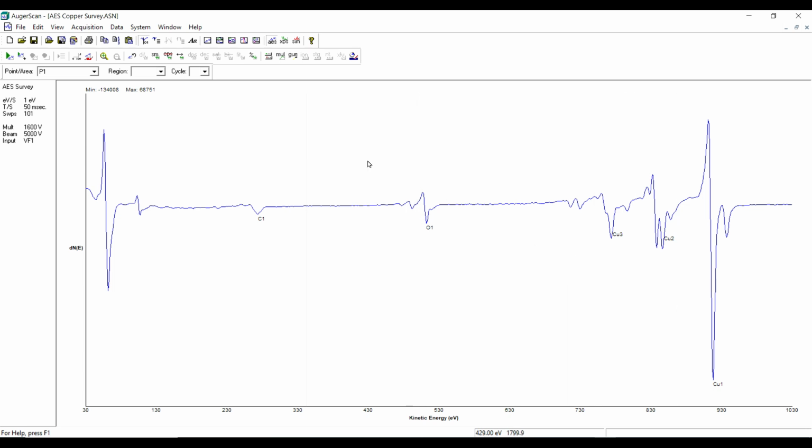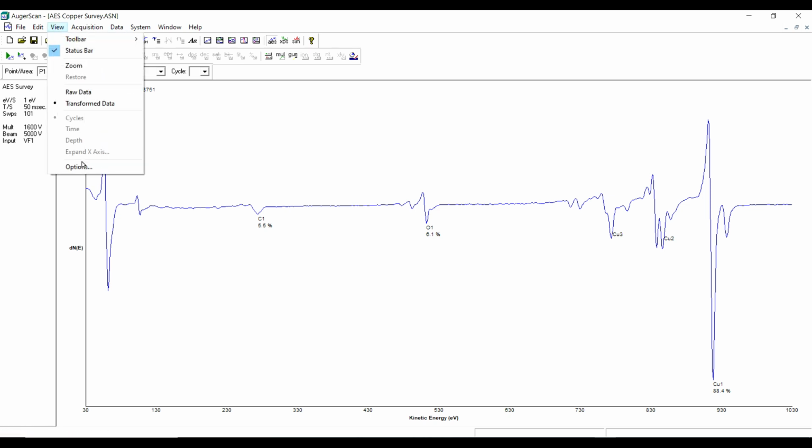And the reason we did it that way was because when we first started designing this feature, a lot of customers told us specifically, don't let the computer automatically pick, because they would spend most of their time fixing the computer picks. And so it's easier for them to just select it themselves. Okay, so we have those selected. Now what we can do is we can turn the marker off, and this little icon over here is atomic concentration. And now let's take a look at View Options.